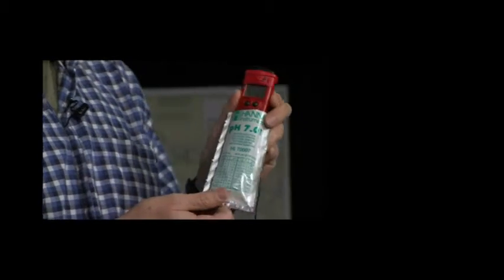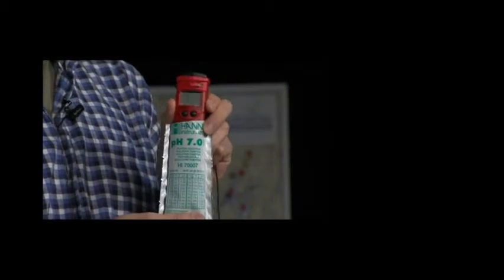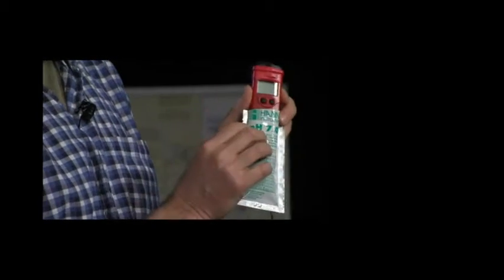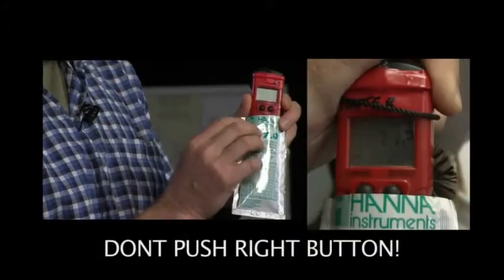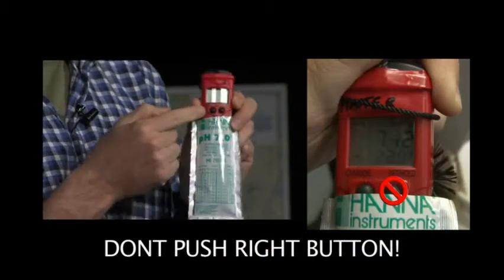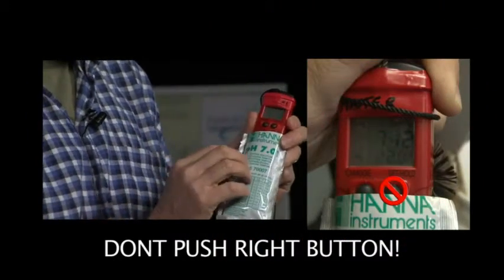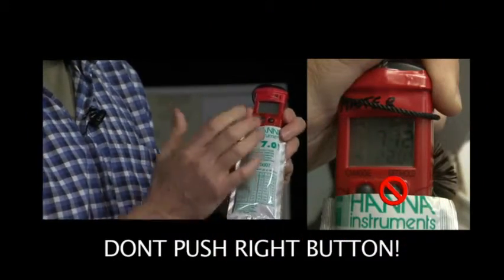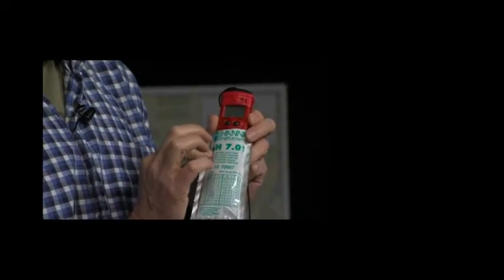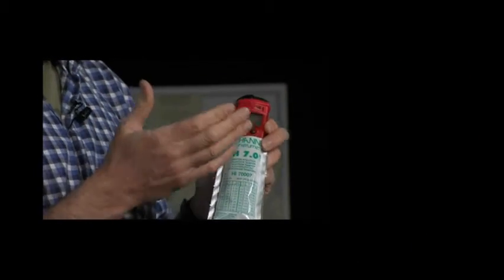When you go to do the calibration and when you're going to use the pH meter, the only button on the face of this meter that you're going to want to use is the one on the left. You can ignore the one on the right-hand side. That actually changes the temperature thermistor from Fahrenheit to Celsius.